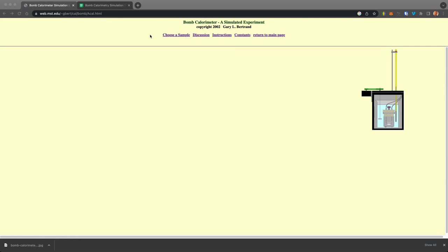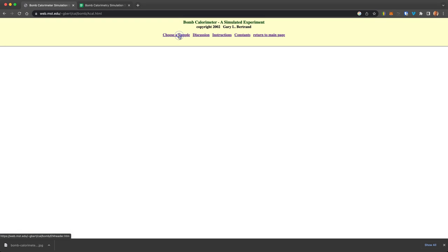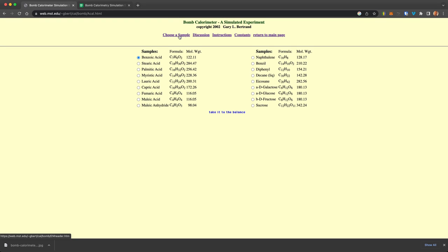So let's just quickly run through this. So you would typically choose a sample. You usually start with benzoic acid as your standard. And you would do just that.